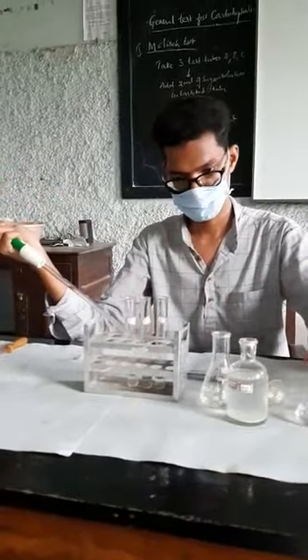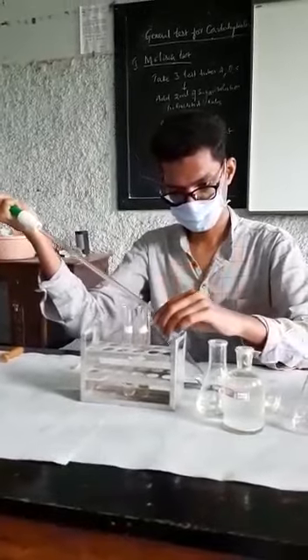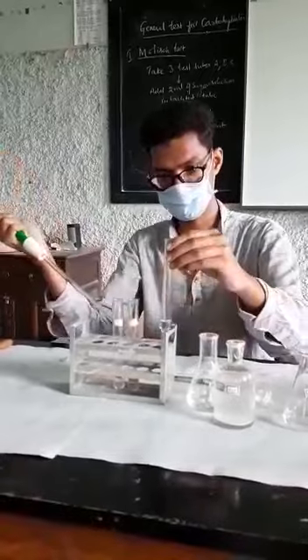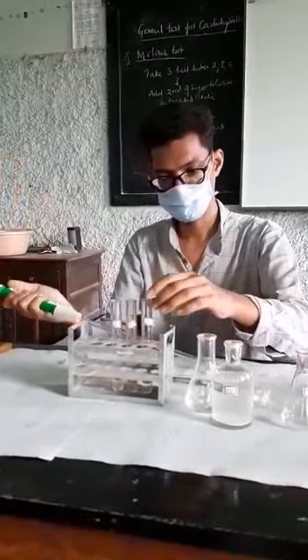He has added 2 ml of the samples in each test tube A, B, C. I have given him 3 different samples and he has added them into 3 different test tubes.